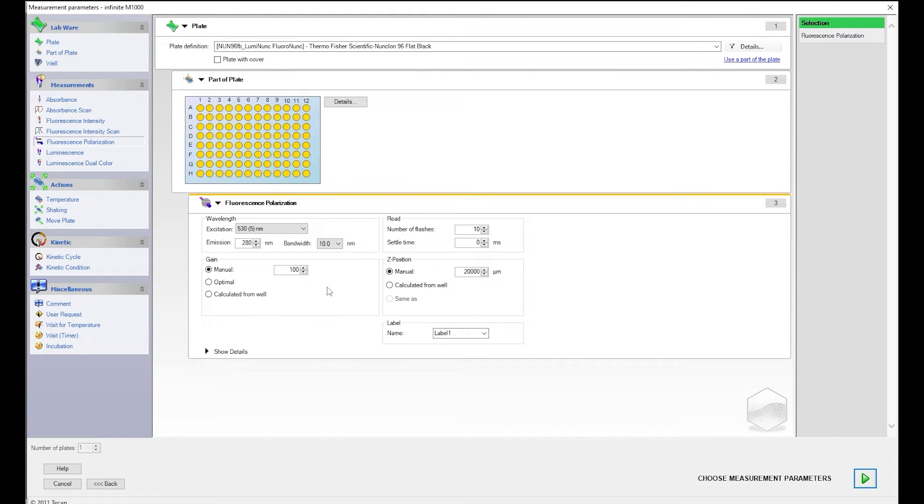Under Gain, select Optimal. Under Read, select your number of flashes. We recommend 10. Under Settle Time, select your time. We recommend 500 milliseconds. For Z-Position, select Manual. We recommend a value of 20,000 micrometers.